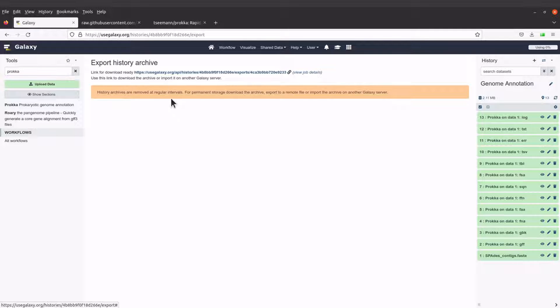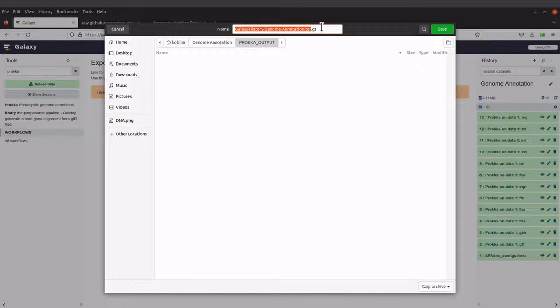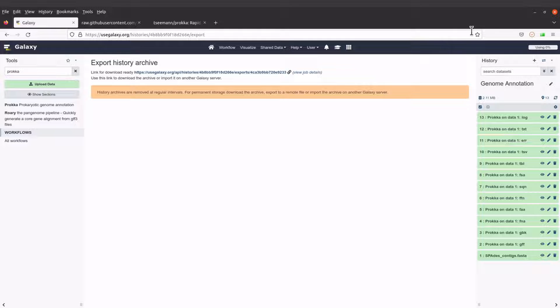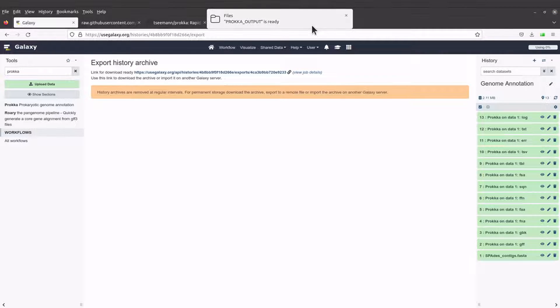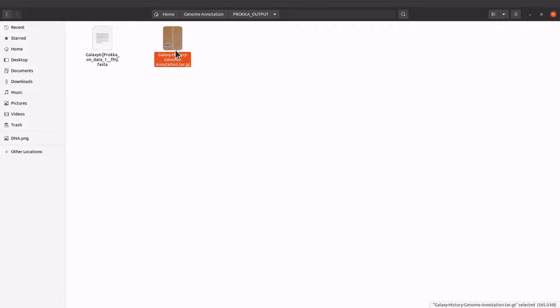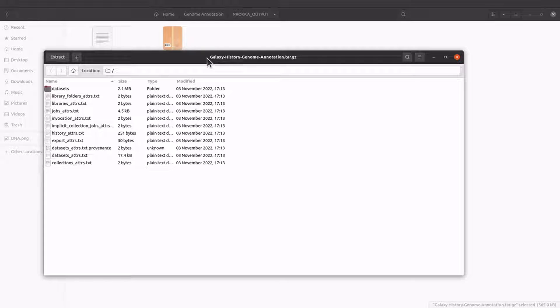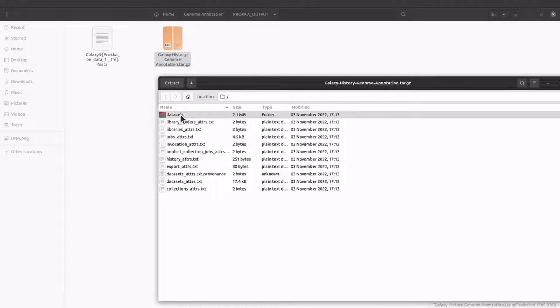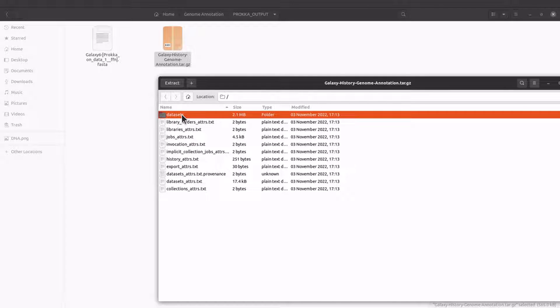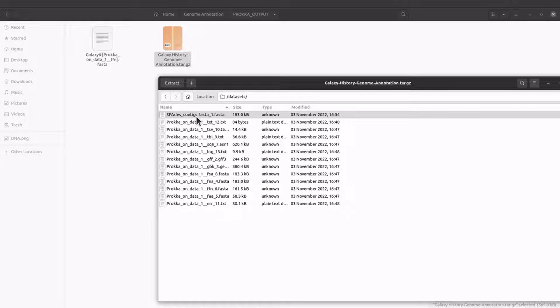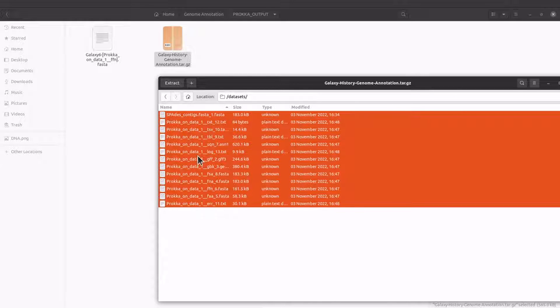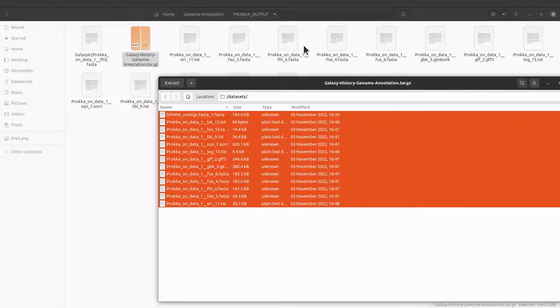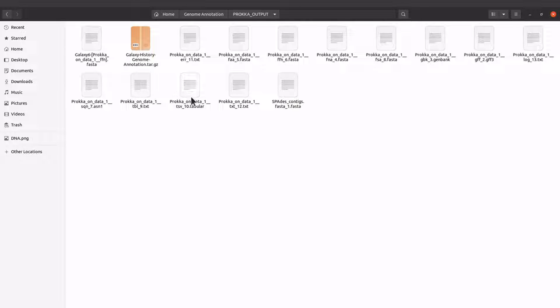Galaxy will prepare all necessary files and generate a download link for you. Once the link is generated, click it and you'll be asked to save the file — it's a .tar.gz compressed archive. Save it to your PC, open it with archive software, select the datasets, and you can extract all the files. You'll have all 12 files available.